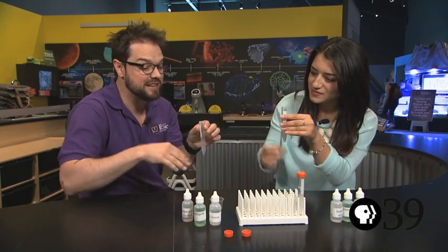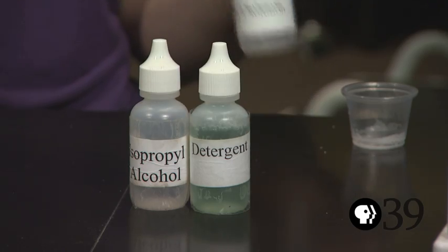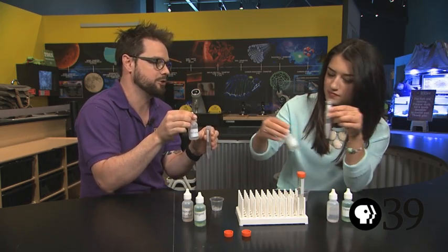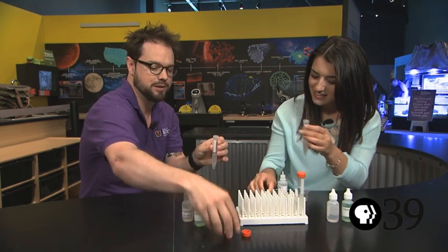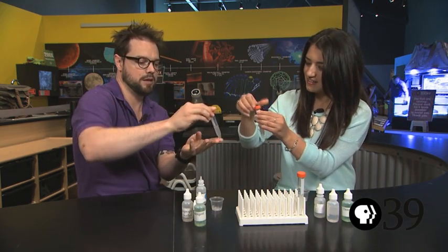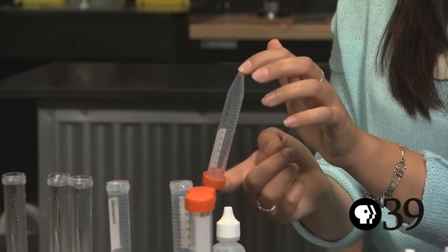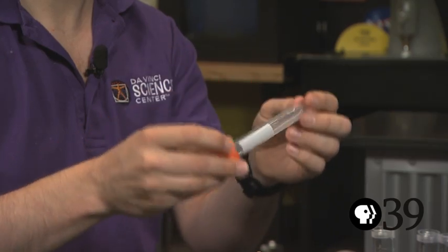Now, as I said, we've got lots of things in there besides our cheek cells, so we want to clean it up a bit. What we're going to do is add some sodium chloride solution, which is just a solution of normal table salt. And then we're going to put a lid on and gently mix it. That should clean up all of those cells, and now we can start getting the DNA out of them.